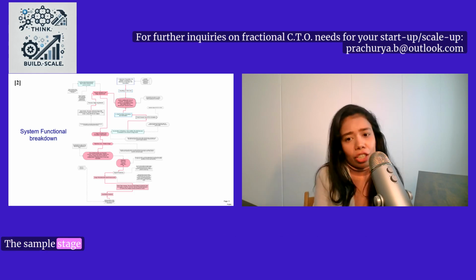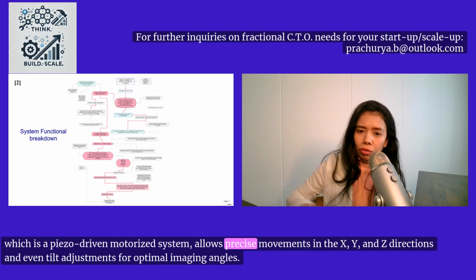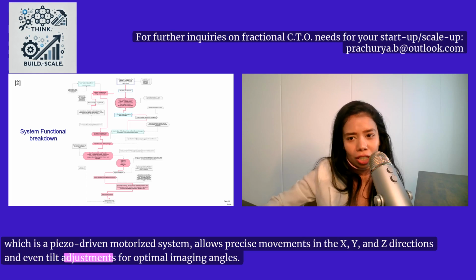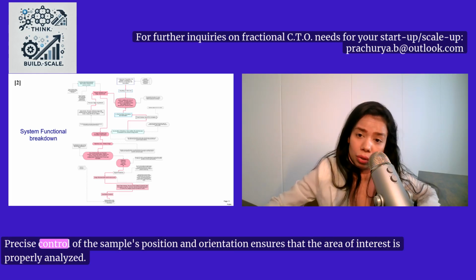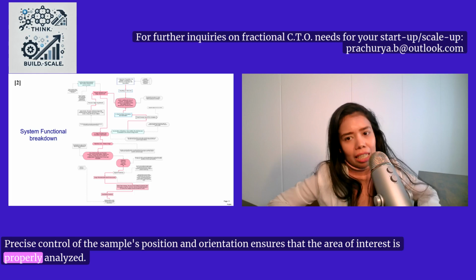The sample stage, which is a piezo-driven motorized system, allows precise movements in the X, Y, and Z directions and even tilt adjustments for optimal imaging angles. Precise control of the sample's position and orientation ensures that the area of interest is properly analyzed.